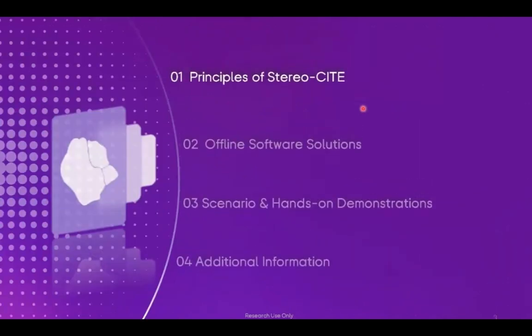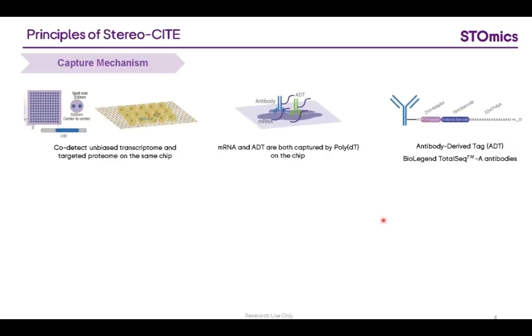Here is our agenda for today. We will start with the core principles of Stereo-CITE technology. Then we will dive into our offline software SW and the StereoMap. Following that, I will walk you through some practical scenarios. And we will finish with some additional information and resources.